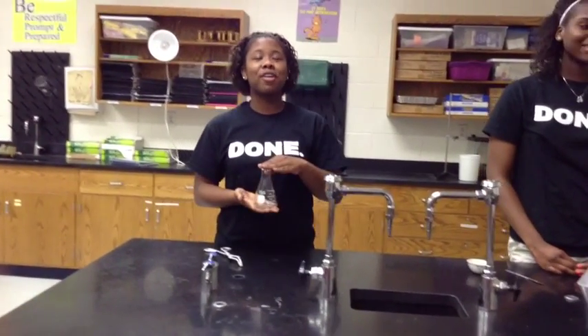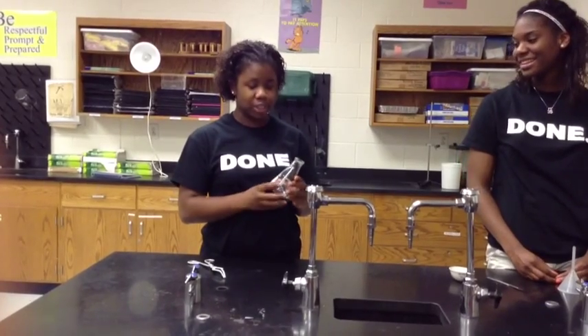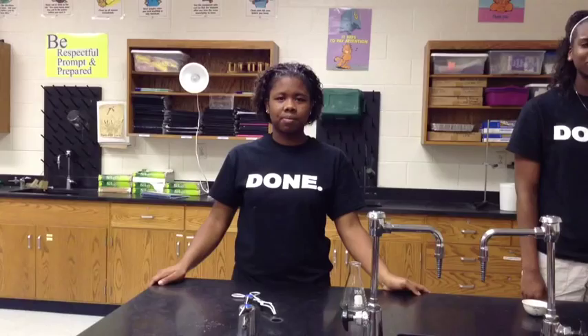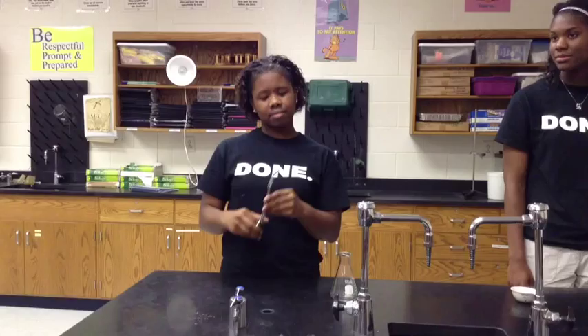This is the Erlenmeyer flask — you pour your liquid into it, you can measure it, and you can shake it up. This is a crucible tong. You pick things up with it, and that's it. Bye!